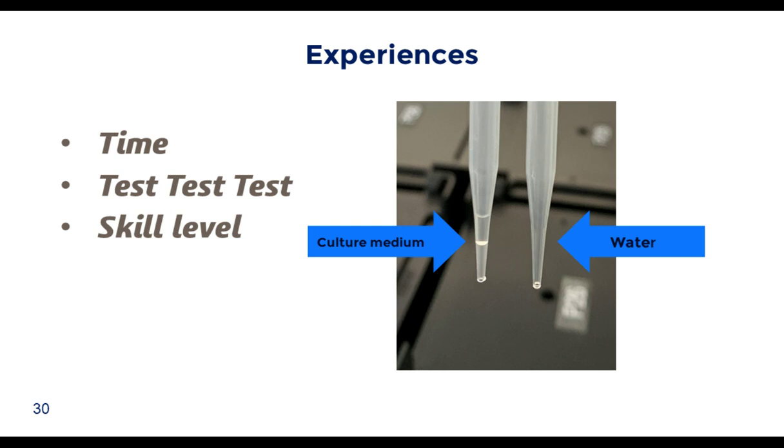Bringing us to the next point, test, test, test. This point was partially addressed in regards to process adaptation, but it is worth mentioning again. Initial tests are run with empty plates to confirm labware movements. Later tests are run with medium.